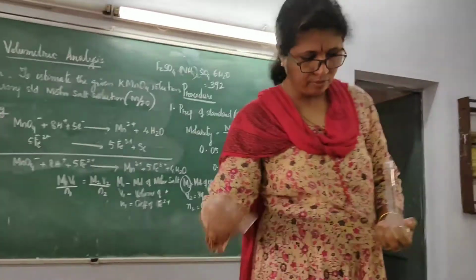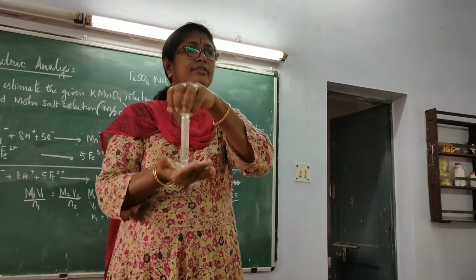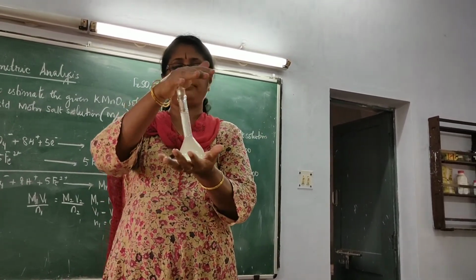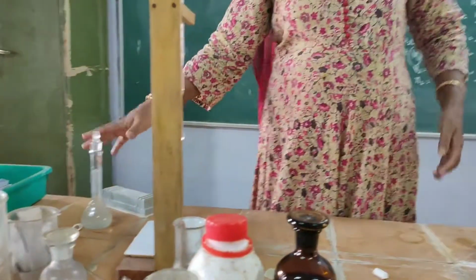So then close it tightly like this. You have to stop it so no solution will go up. See how? Okay. So we have prepared the Mohr's salt solution.